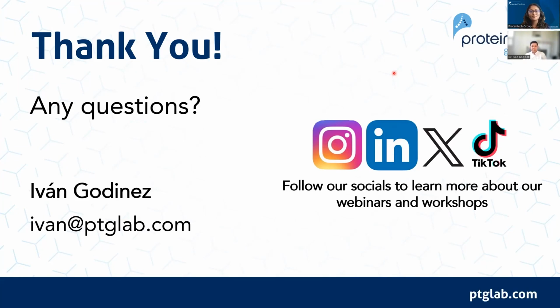We've done it in-house. We're still kind of new in this space. We've been around for a few years, and as individuals we have lots of experience, but as a company we launched our first product in November, and we're doing tons of development work right now. We hope to launch a lot of kits, along with cell hashing, nuclei hashing, and other relevant assays sometime this year. So we're working on it for sure.